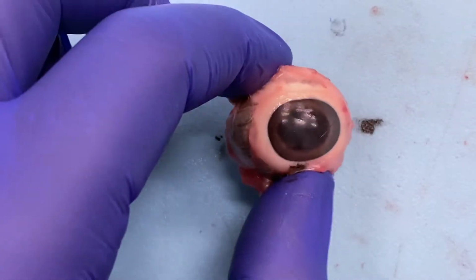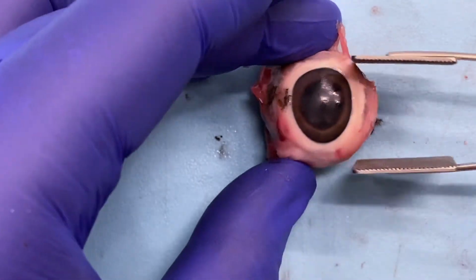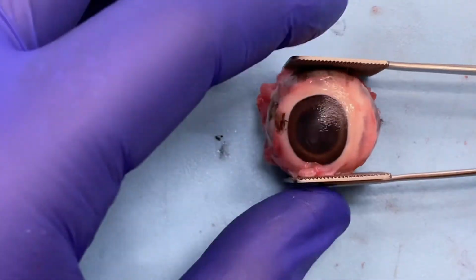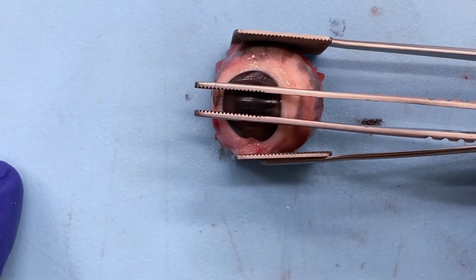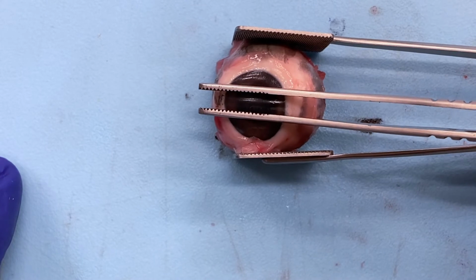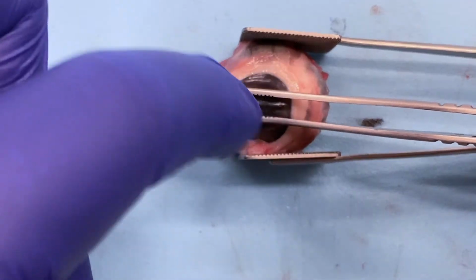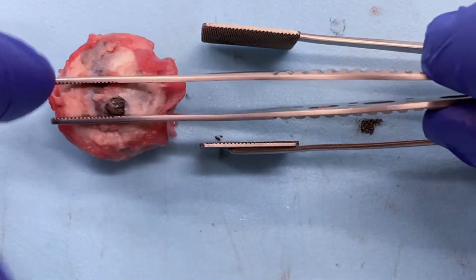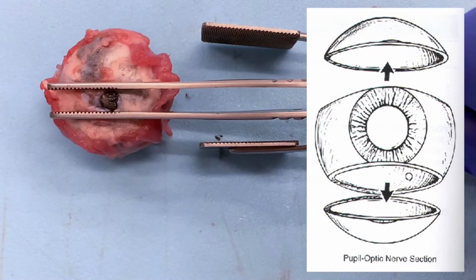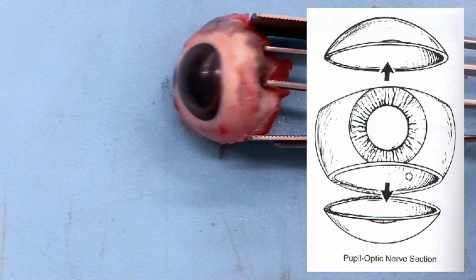Okay? So, since my tumor's here, I want to make the plane of cut this way. So let this forceps kind of indicate what my section will ultimately look like. Whereas I'm going to have to cut here and keep that pupil intact. And then if I roll this over, I'm going to try to make sure that the optic nerve is still contained in that section.